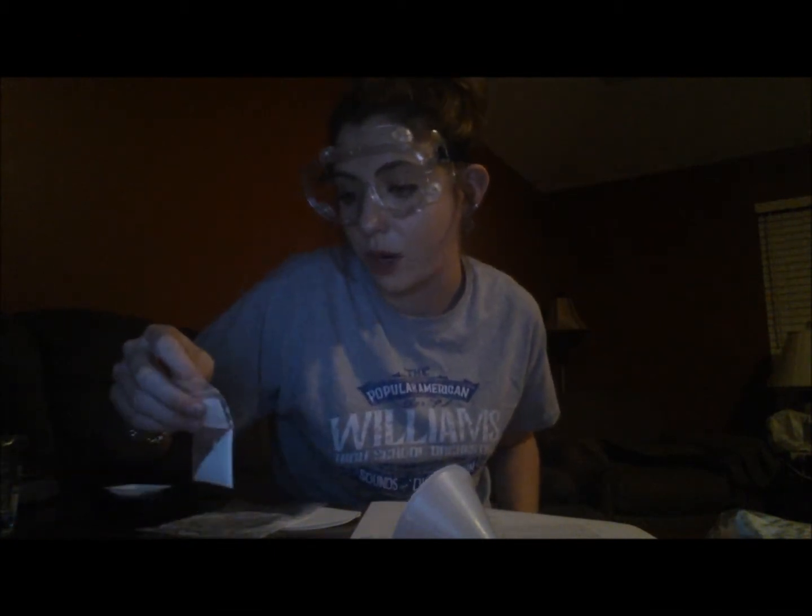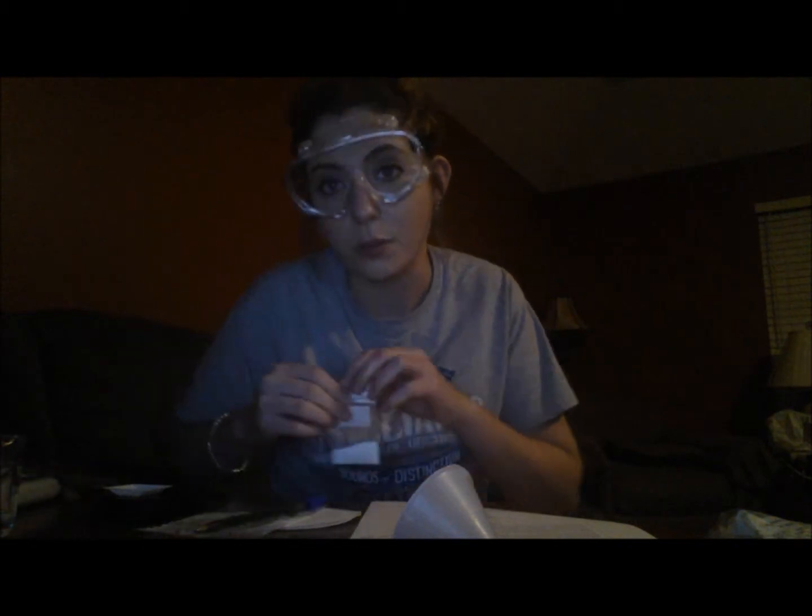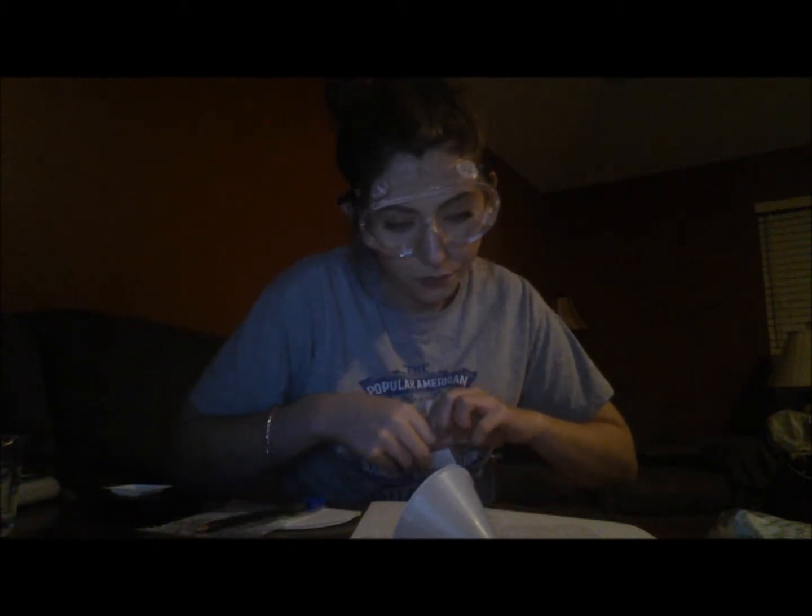So now we have to use stoichiometry to determine how much Na2CO3 I will need for a full reaction. I'm just going to pause the video there and calculate that. According to my calculations, I need about 0.68 of the sodium carbonate, the Na2CO3. So I'm going to go ahead and weigh that amount out. Looks like I need another cup. I'm going to pause it. So, got a cup. Got another one just in case. Using stoichiometry, I calculated that I need 0.68 Na2CO3.